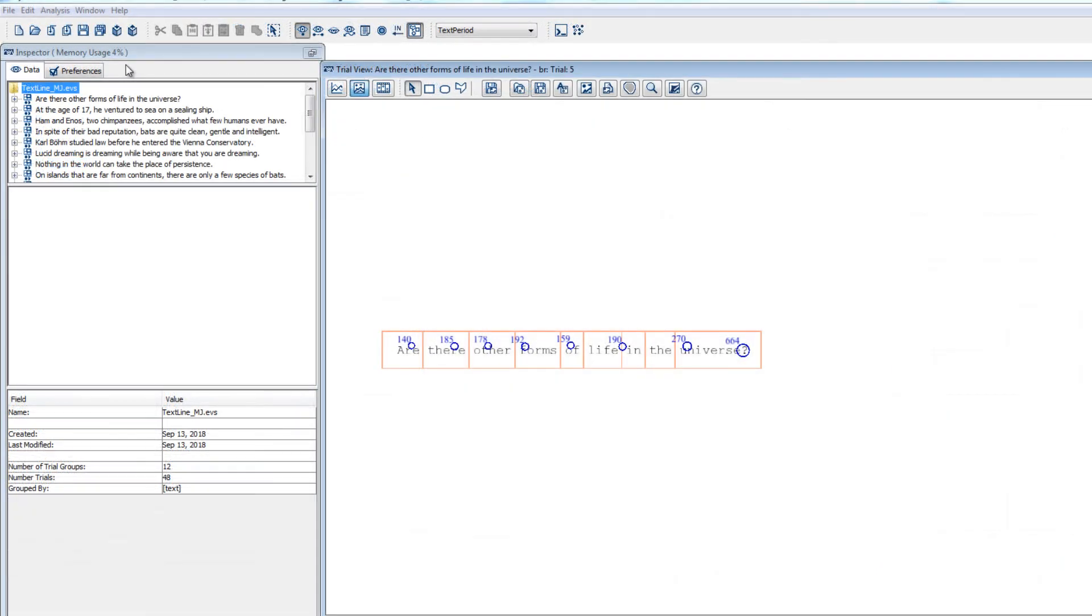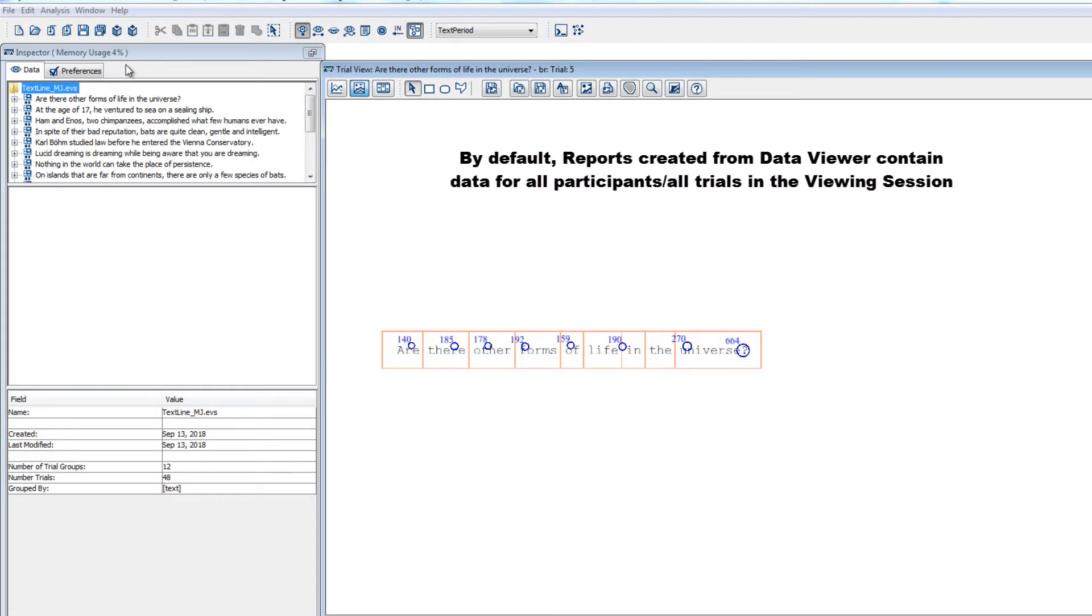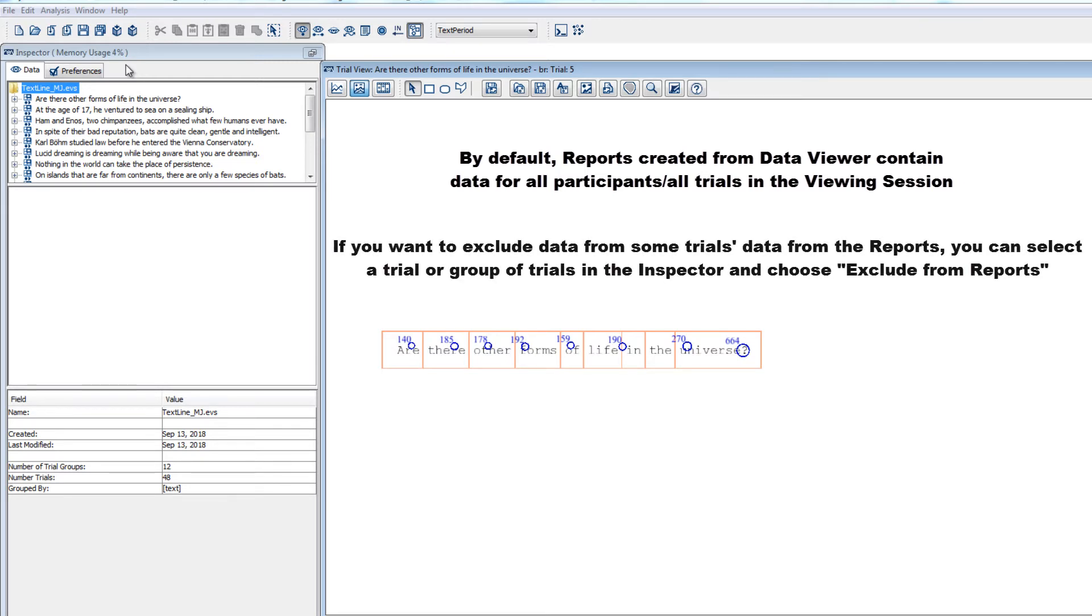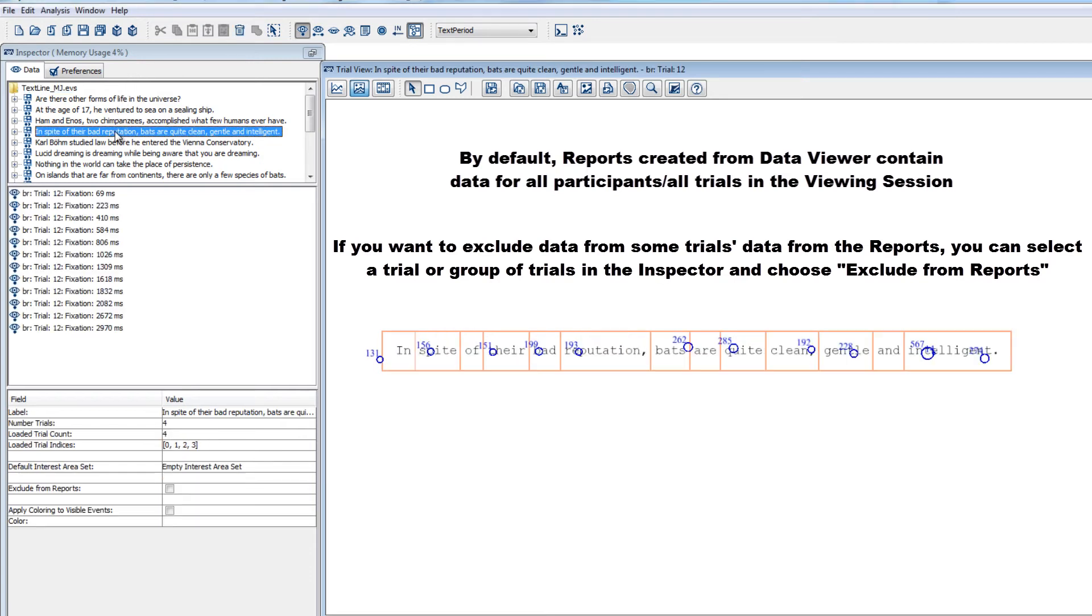For all of the reports, by default, the output file will contain data from all participants and all trials in the viewing session. If you want to exclude some trials from the reports, then you can select a trial or group of trials in the inspector and check the property exclude from reports.